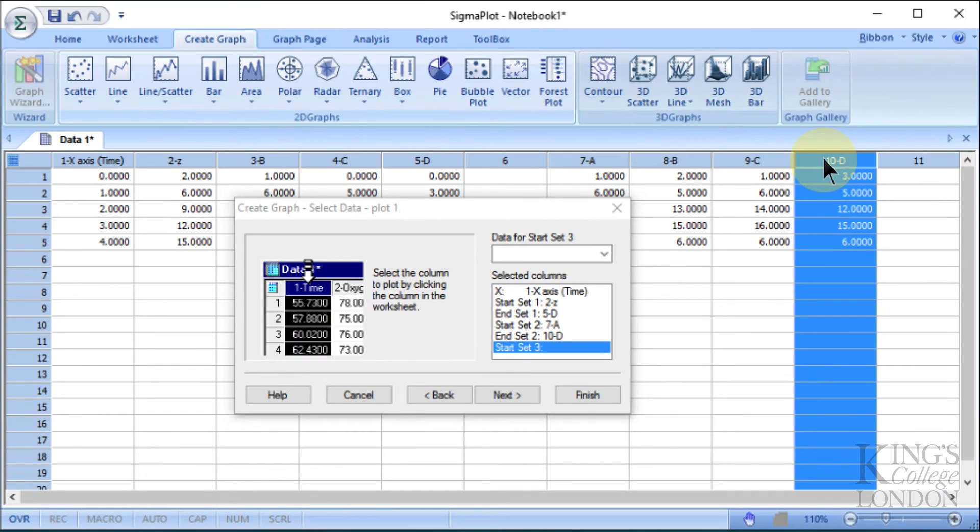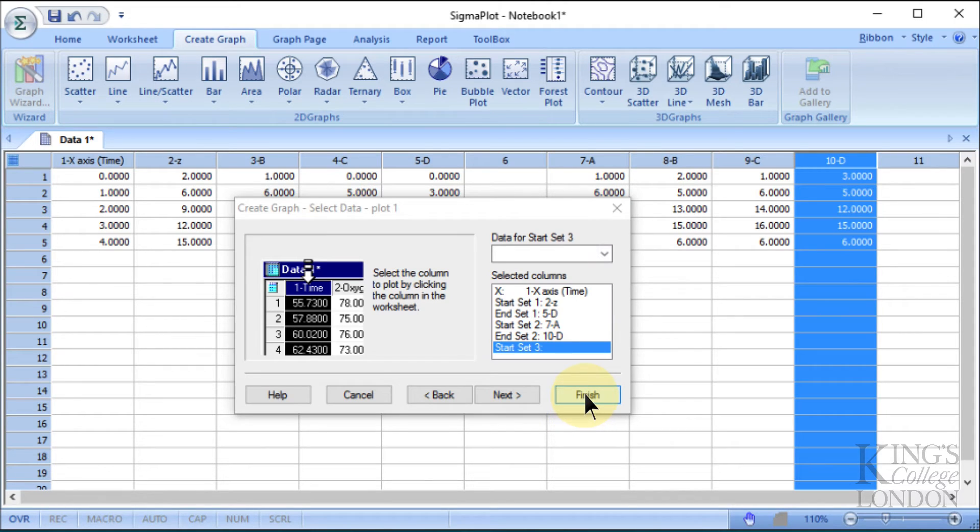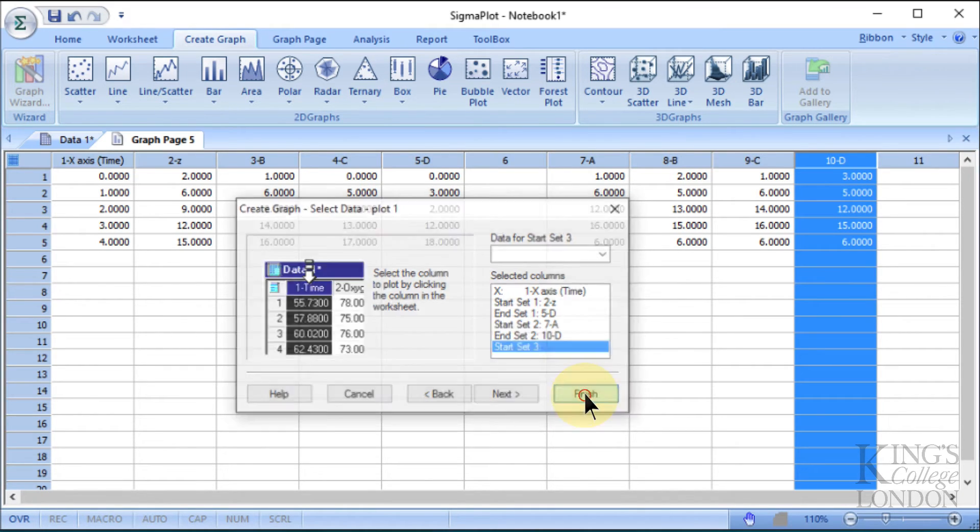If we were to have more data sets, we could continue selecting multiple data sets until we have completed it, but since we only have two data sets, we will say Finish, and it'll create our graph.